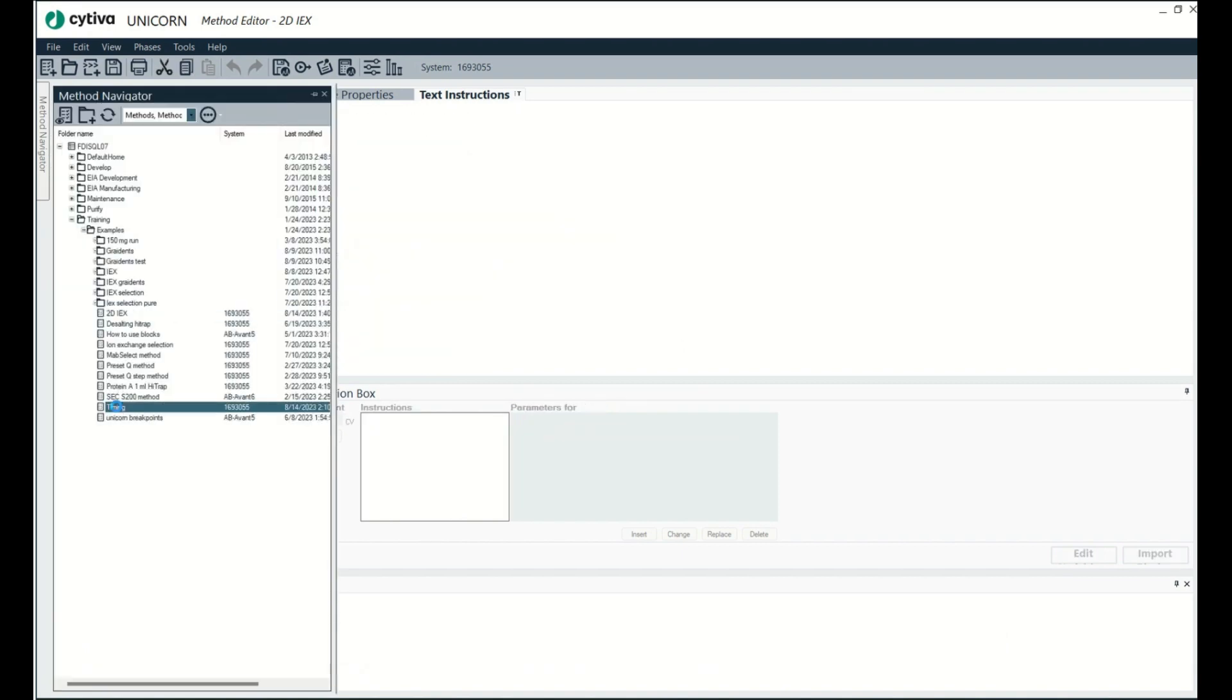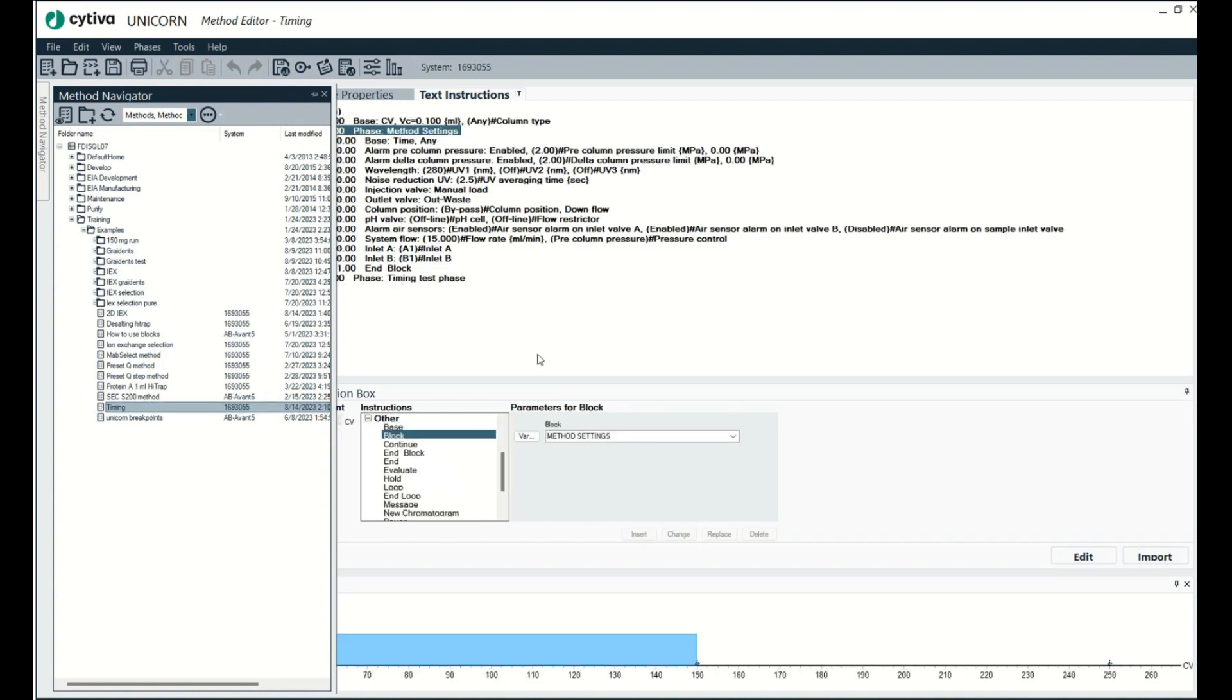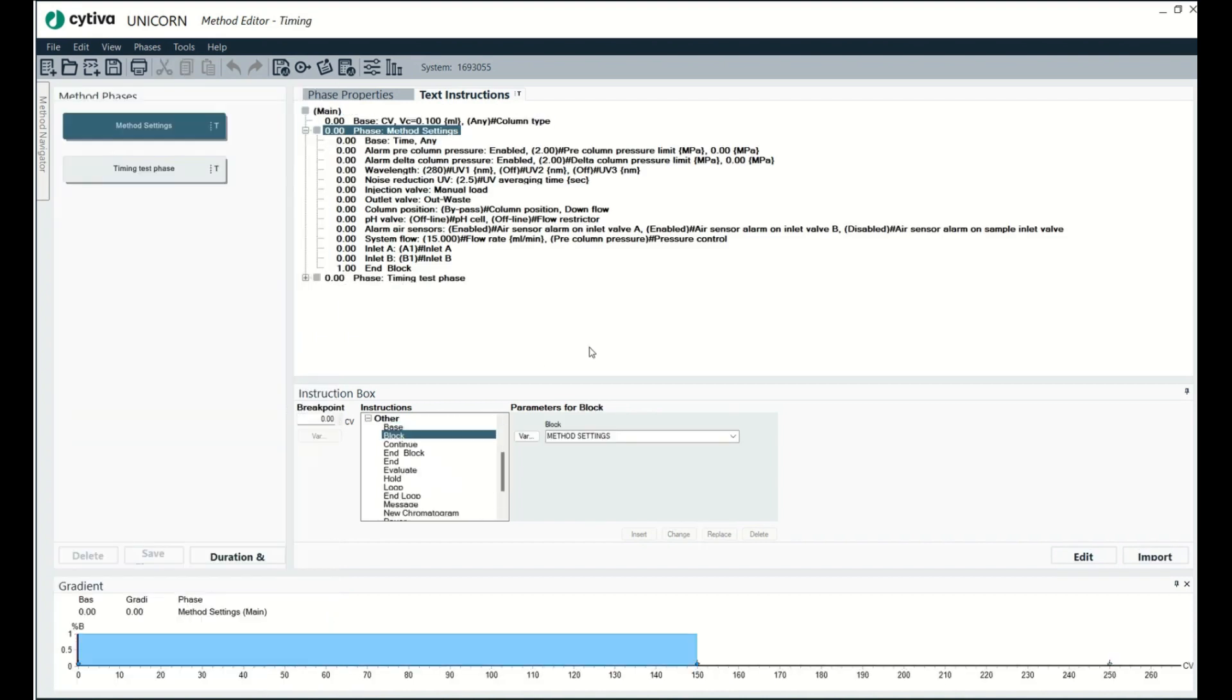Okay, so I'm going to go to this file here called timing that I've never done anything with really. I don't really care about this file, which is why I will do this with it.